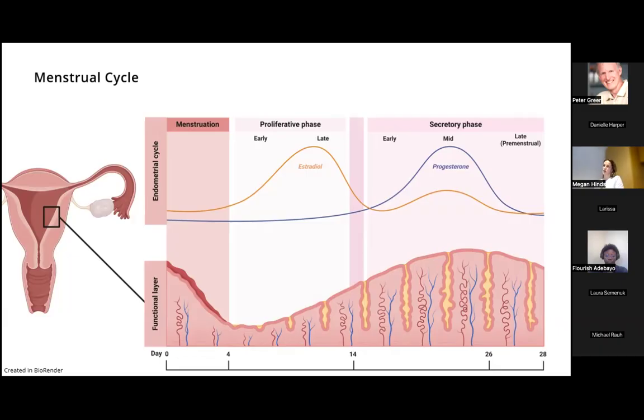Yeah, I was just wondering if there was an easier way. So if you can do a quick spin down and have a look on the slide, but I don't know what that would look like. Yeah, it's hard, because there's just a lot of contaminating cells no matter what. And it's not just fibroblasts, there's tons of immune cells. I can see them when I look at them.